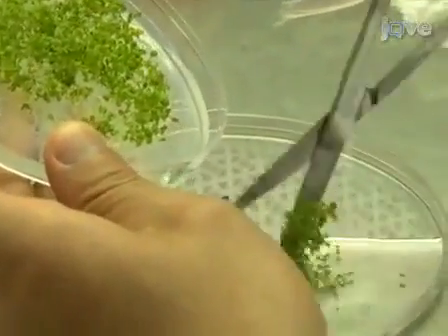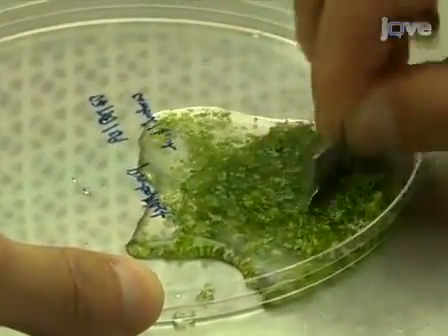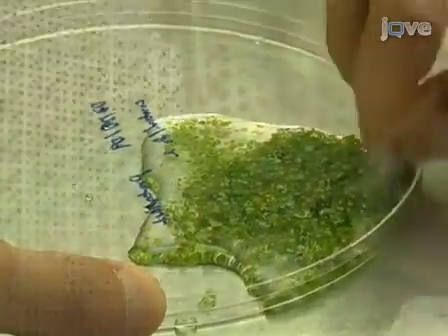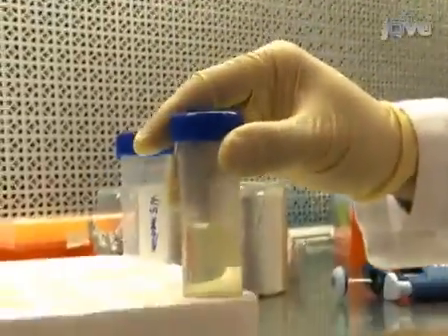We use this procedure in our laboratory to study the subcellular localization of proteins of interest, for isolation of intact organelles, and for the functional analysis of genes using double-stranded RNA interference. So let's get started.